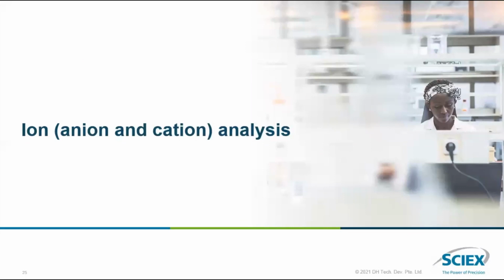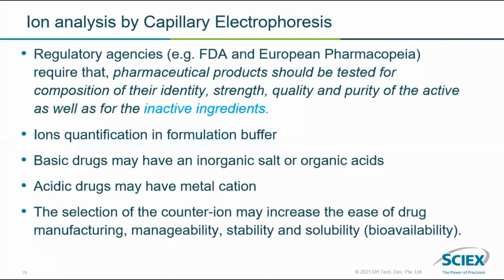So now we'll talk about ion analysis using capillary electrophoresis technology. Ion analysis by capillary electrophoresis is a very important technology to quantify the anions and cations present in your formulation buffer or sample. So why do we need to quantify ions by CE or any other method?